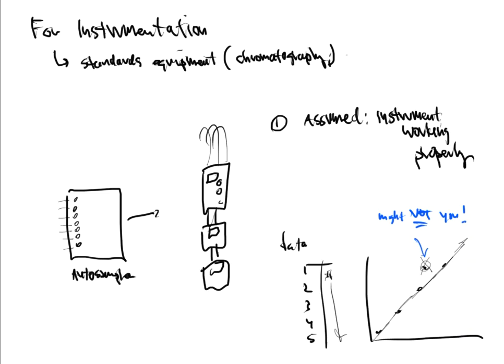It's the samples that would cause a problem, because what if this was a sample? Then we would have a bigger problem, because I would have no clue that this would have been messed up. I would have had no clue that that machine actually injected a little bit more or a little bit less compared to everything else. And my data for my samples depend on those areas, that amount that was injected every single time from the equipment.